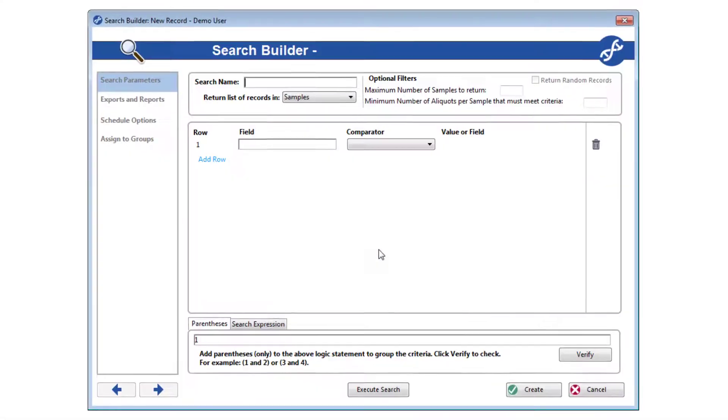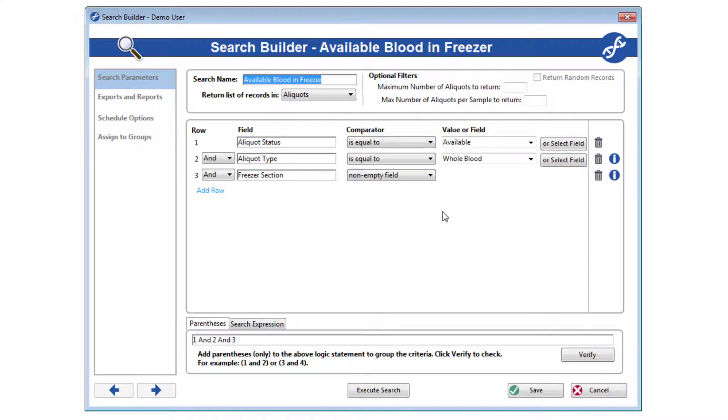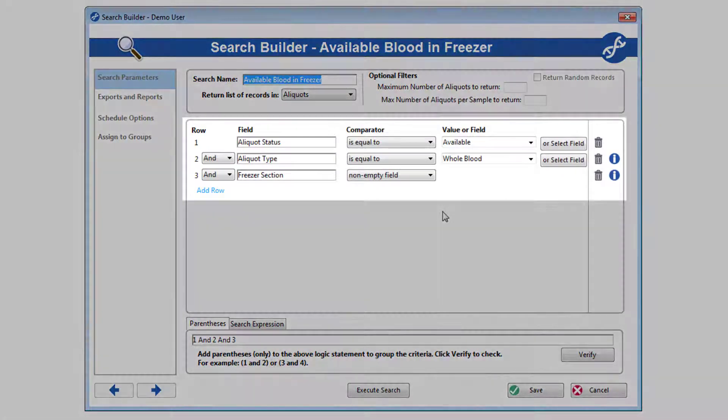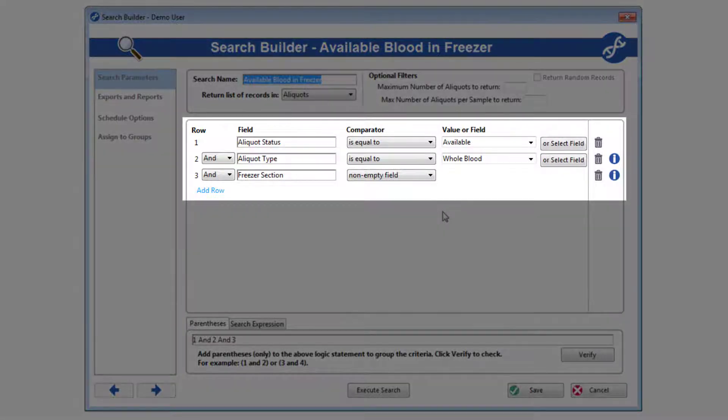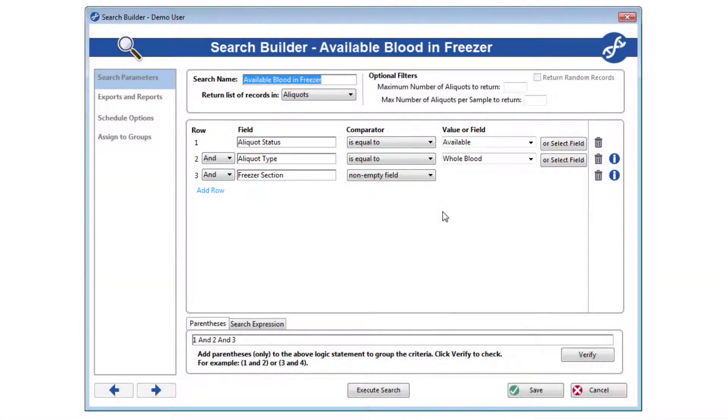For saved searches, think about a search that you run on a consistent basis, possibly on a schedule. I've created one where I'm looking for all of the available aliquots with whole blood types and freezer positions. Execute the search.